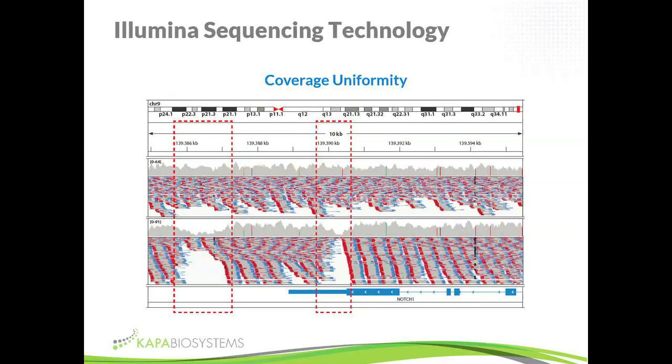It also increases turnaround times. And in worst case scenarios, we may have to use completely different techniques like Sanger sequencing to fill those gaps. So, as I said, the first answer to the question of what the objective of library construction is, is to make a library that allows us to get the highest and most uniform sequence coverage for every single position in the sequence region that we're interested in.